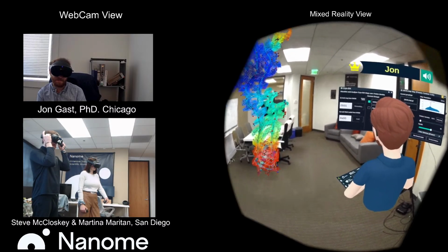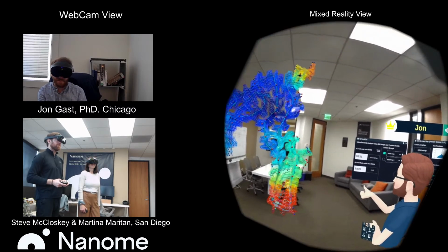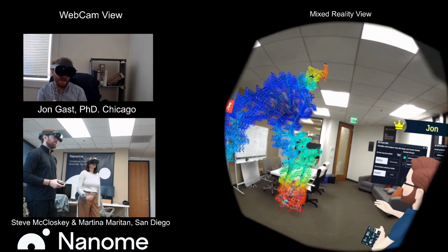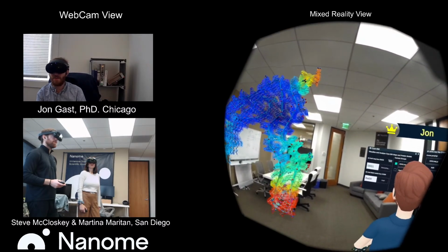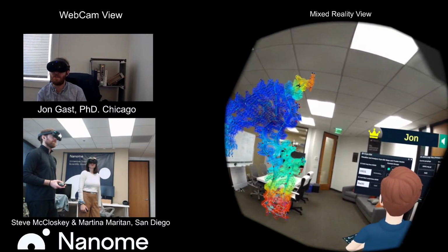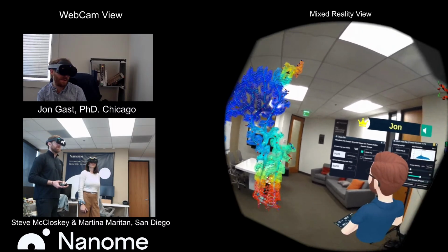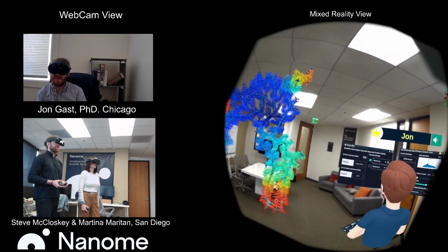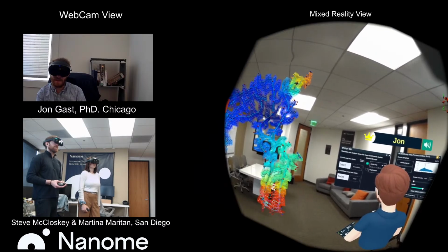That's two birds with one stone, because the last question that we have here is, does the plugin only work on models from certain databases? And it sounds like the answer is yes. Currently, just EMDB and RCSB, but they have agreements with other databases where they'll often get co-submitted there. So you should be able to find a good breadth of them, but currently we don't have a load-your-own-model setup yet.